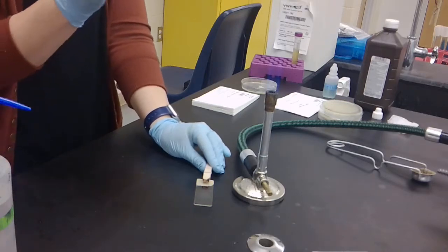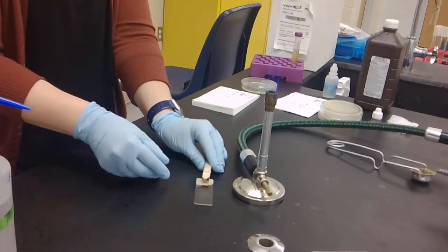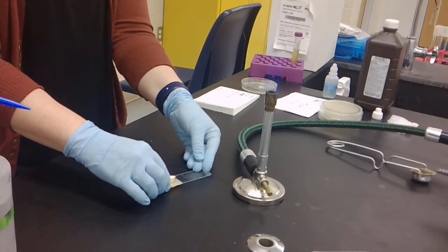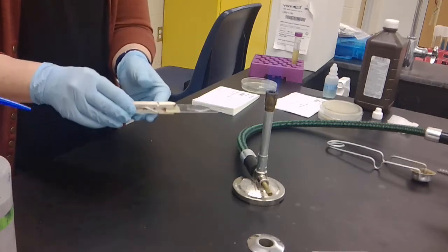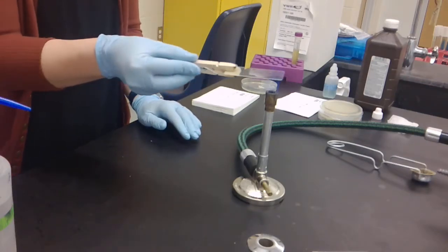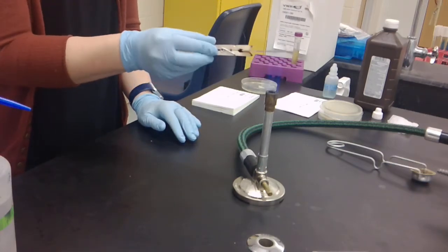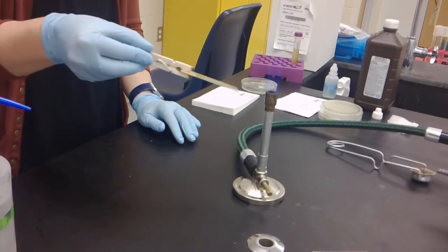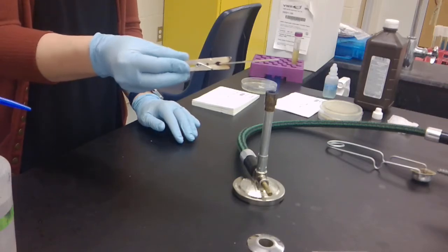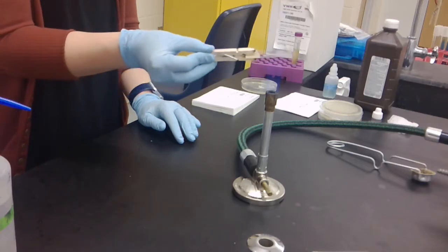So we are going to use heat from our Bunsen burner flame to actually dry the bacterial suspension onto the microscope slide. And when you do this, you have to be careful to not let your slide get too hot. When glass gets too hot, it will break and shatter. So you want to move your microscope slide very quickly in and out of the Bunsen burner flame, allowing the water to dry on the slide. You can move the slide around, you can spread your water out, but after you've had your slide in the flame a few times, you want to move it out and give it just a few seconds to cool.